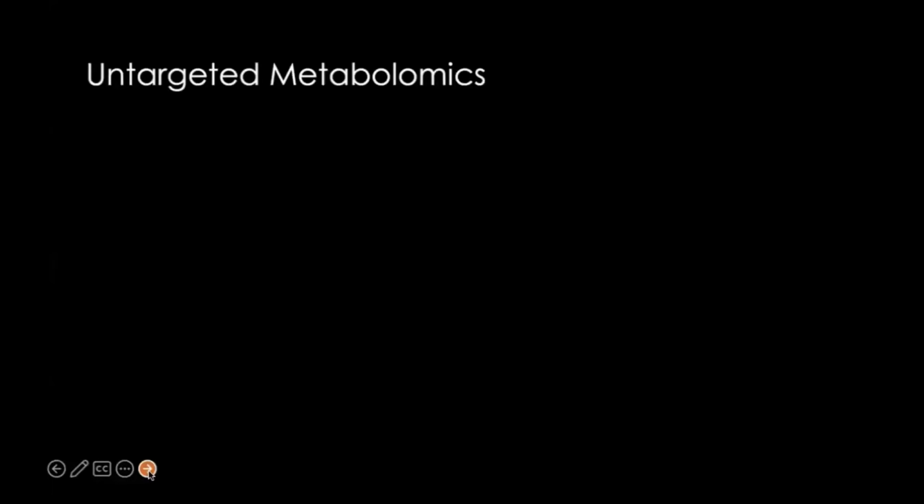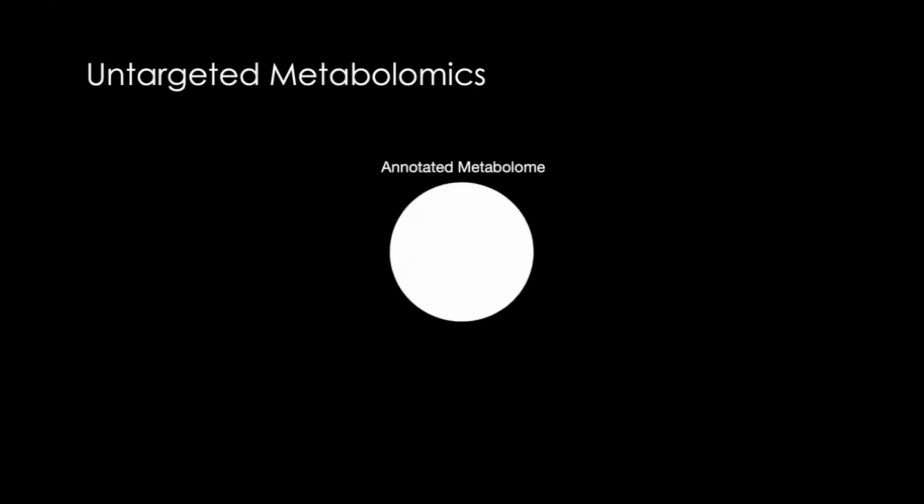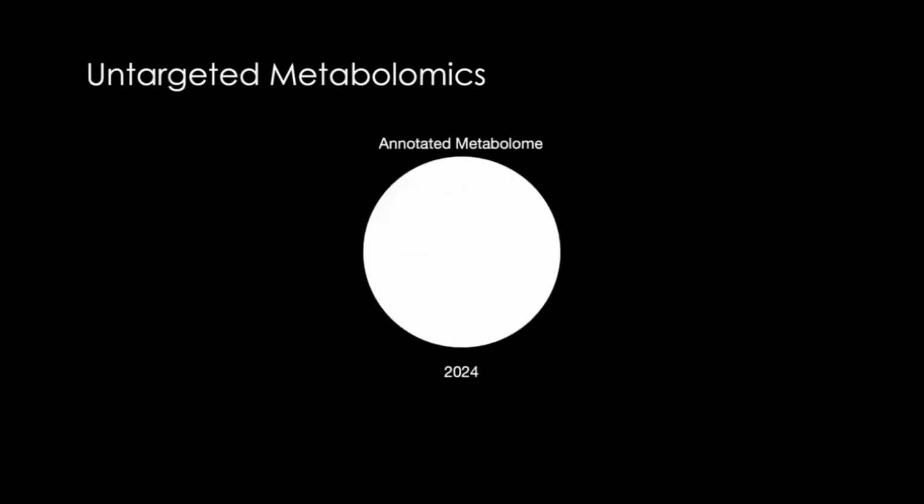The way to think about untargeted metabolomics data is that you want to see as many molecules as possible. It's very similar to if you do a metatranscriptomic experiment or a metagenomic experiment. You want to get as much sequencing information as possible, and then you do data analysis with it. And so one of the things that many people will do with untargeted metabolomics is try to annotate the information that's embedded in it. Now, when we did this in 2016, we had an average annotation rate of 1.8%. And so 98% of the data remained uncharacterized at that time. This has now grown on average to 14% of the data being annotated.